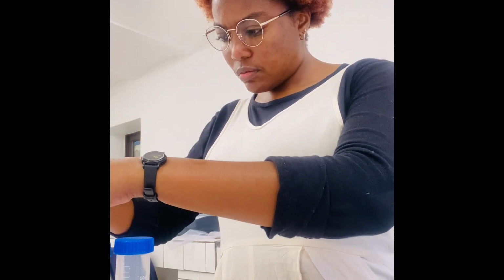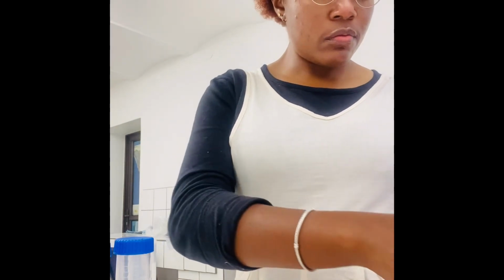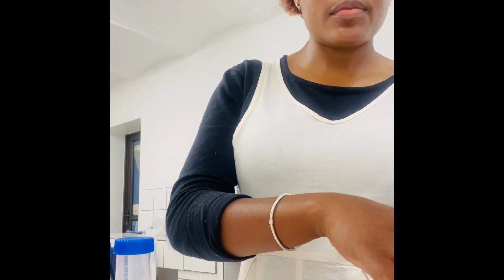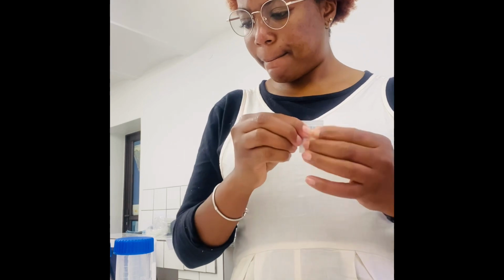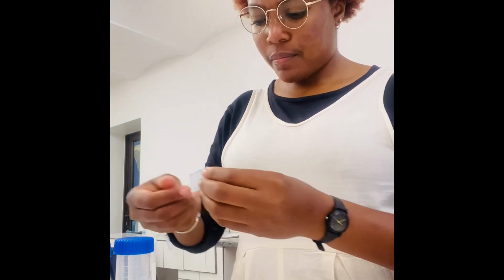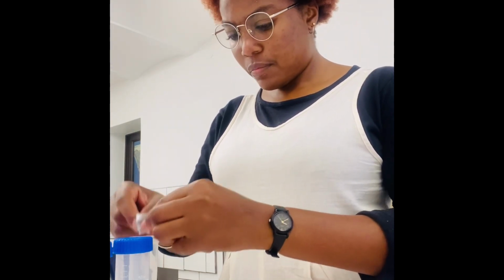So and then also in the video you will see how the powder pillows are scattered all over. And while I was waiting, I just had to quickly go and clean up those ones that I was finished with already, and just let them air dry.